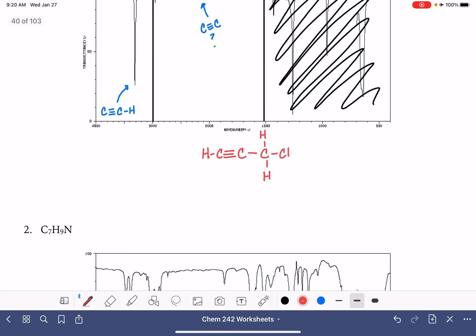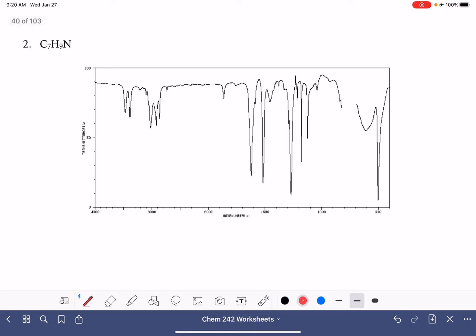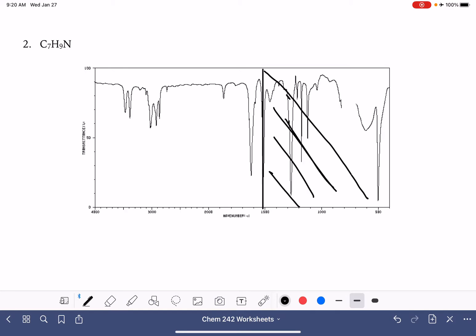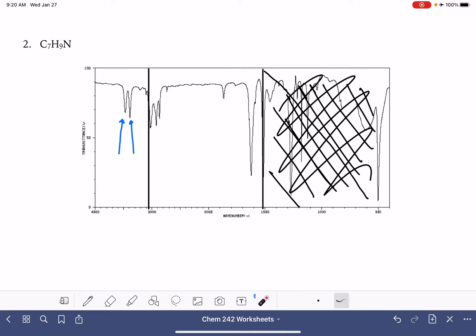Let's move on to the next one. This molecule's formula is C7H9N. Since I know that I have a nitrogen present, I'm going to be looking for NH bonds to the left of the 3000 line in this special hydrogen area. I'm beginning by ignoring everything on the right-hand side of the 1500 line. We're looking for the NH peaks because the formula indicated nitrogen is present. Since there are two NH peaks, that means I have two NH bonds.